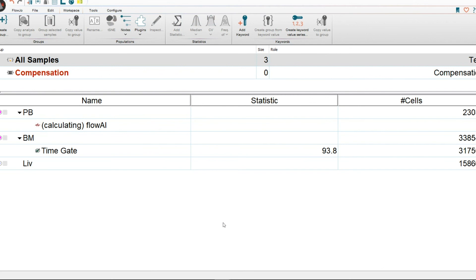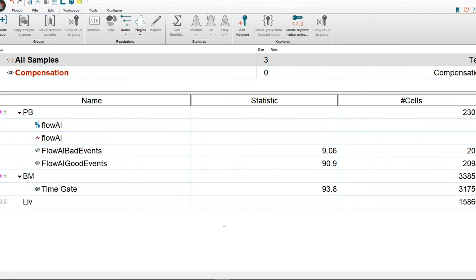And in a matter of a minute or less, we will get an output of the FlowAI good events and the FlowAI bad events like so. Well, as you can now see, we got about 9% as FlowAI bad events and about 91% were characterized as FlowAI good events.